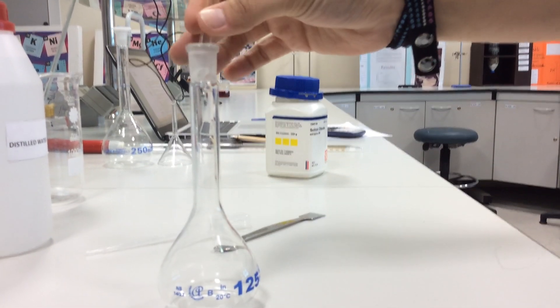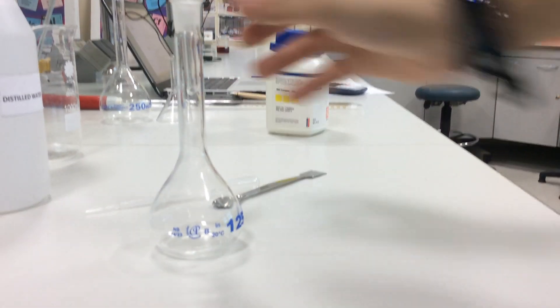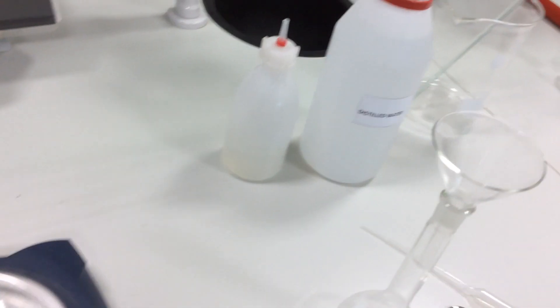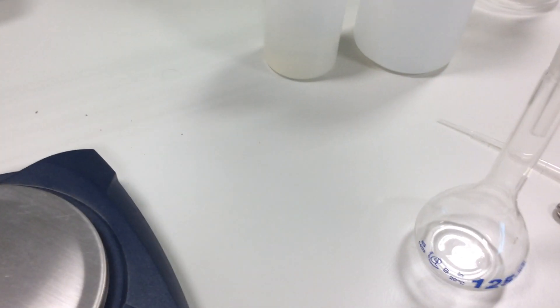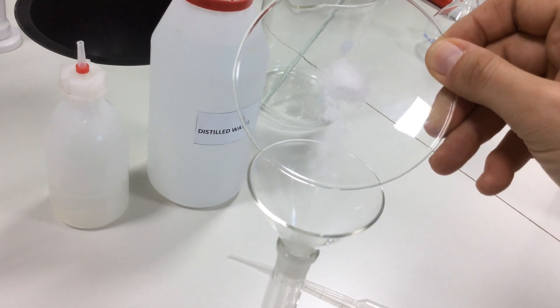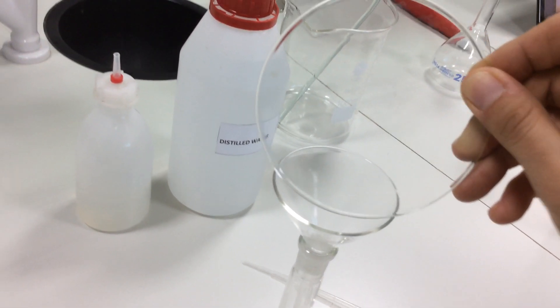Now I will take the volumetric flask and I will put the funnel in the volumetric flask. When I want to add the salt, I should wash the water glass with water. Let us add all the salt.